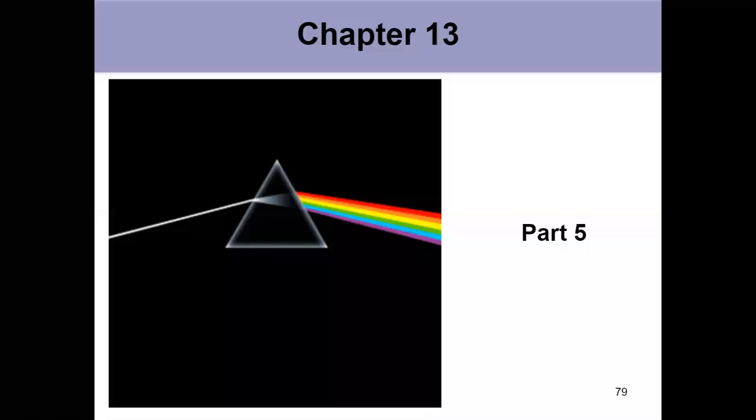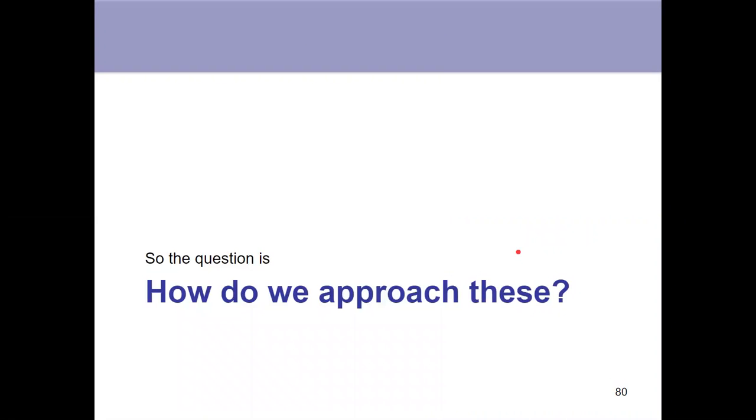In part 5, we're going to finish up IR by figuring out how we actually approach these infrared spectra. Okay? I'm given this spectrum. What are these peaks telling me? This video is all about practicing that. So make sure you're good with the previous 2 videos before we get into it.